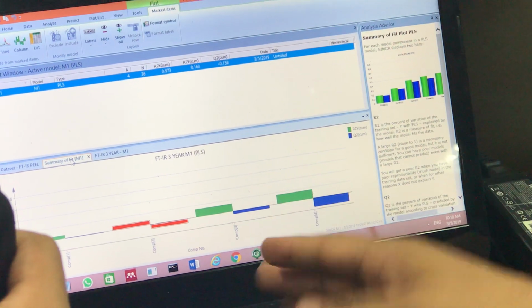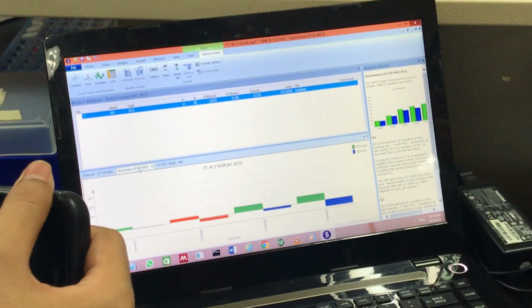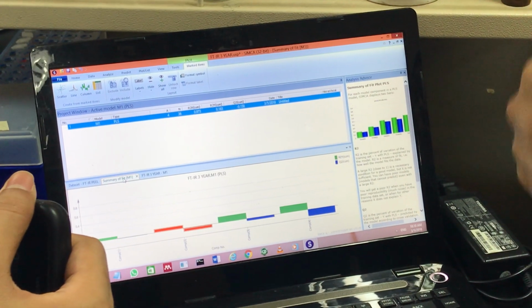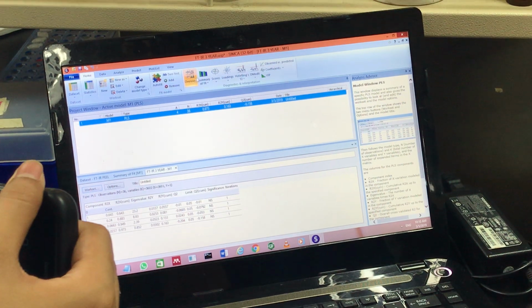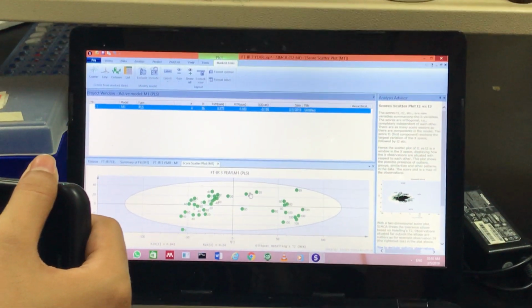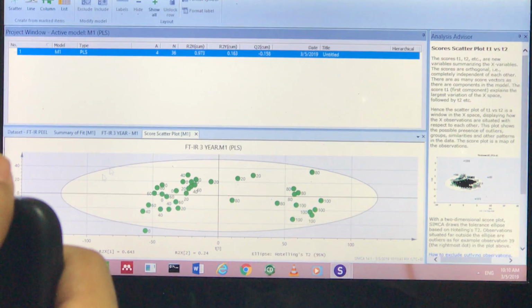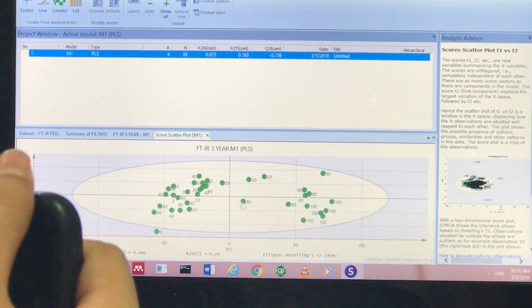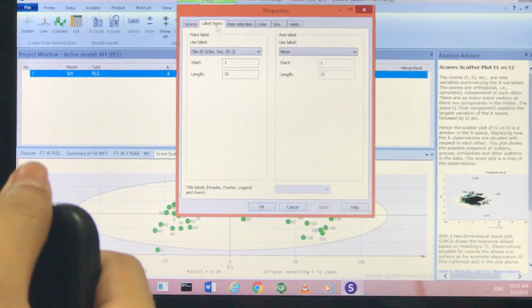For that, this data has no significant difference, but I ask the software to see the difference. I propose a component difference. We can see here. Go to the scroll. This is that. You can see here the description of the extraction. Okay. To be clear for you, I will just.